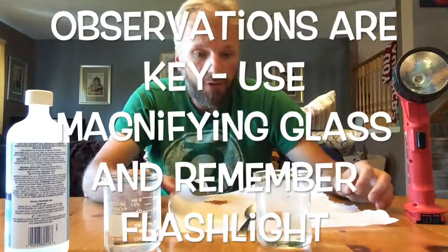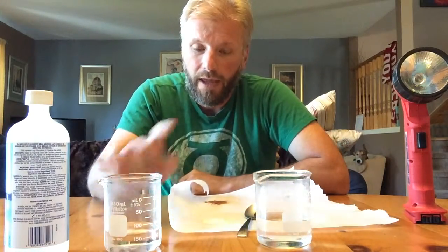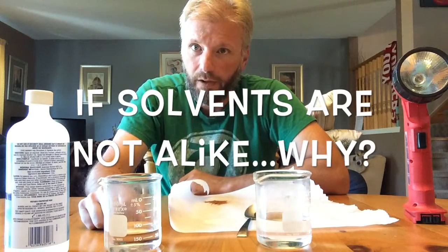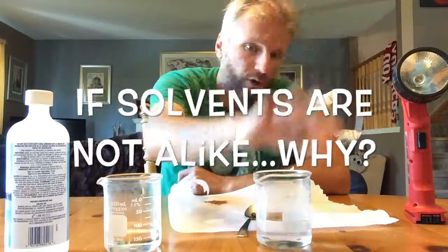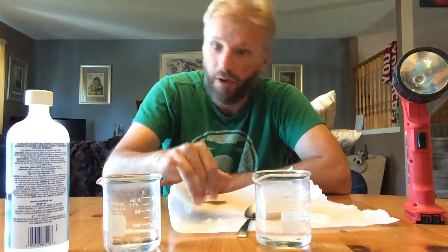At the end, what I want you to do is tell me, first of all, are these solvents the same? And if they aren't, why do you think they differ? If something doesn't dissolve in water but dissolves in here, why? Or vice versa, if something doesn't dissolve in ethyl alcohol but dissolves in water, why wouldn't they? They're both the same chemical composition, so sugar, sugar. Why is it dissolving in here? Or why is it not dissolving in here?